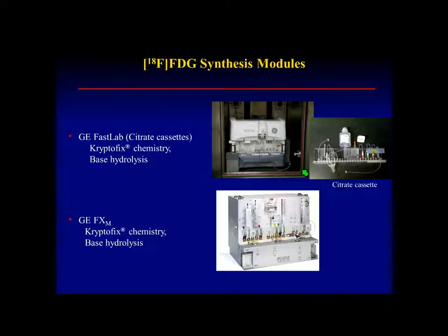This is also a GE FXM. Previously, it was a coincidence module. We actually brought this one in-house in 1999, and it's still a workhorse. It's done very well for us. GE bought the rights of this particular module. And we typically alternate these in a day.